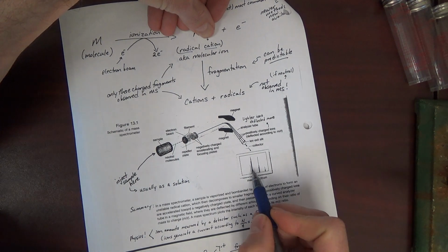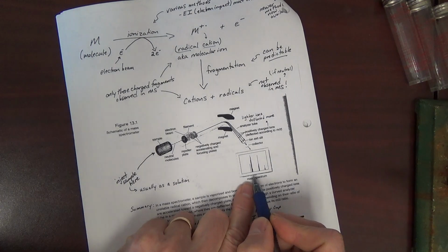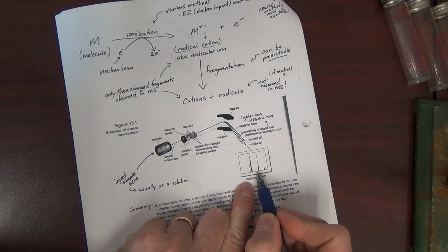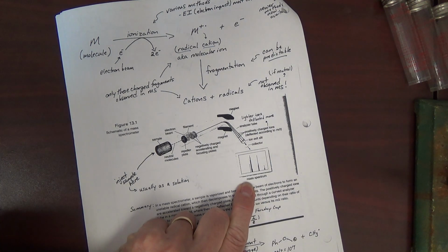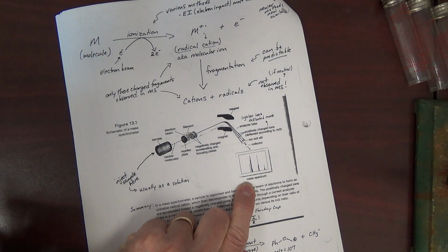But essentially, we can get a mass spectrum, and the mass spectrum is essentially telling us the mass. It's really telling us the degree of deflection. But the degree of deflection corresponds to the mass. And so it essentially corresponds to the mass.